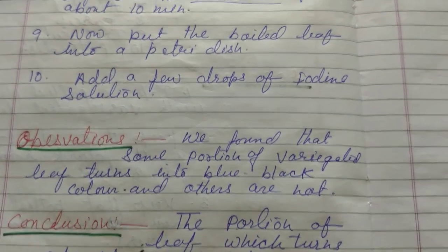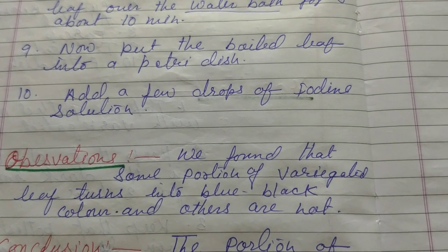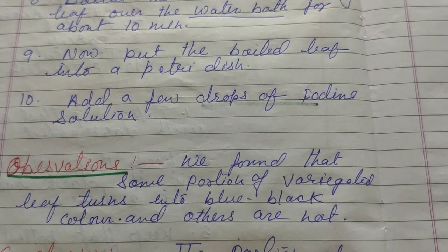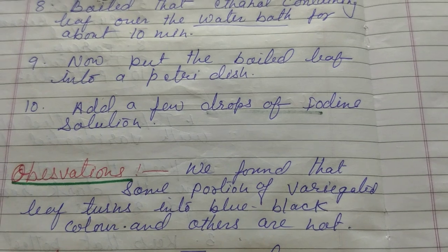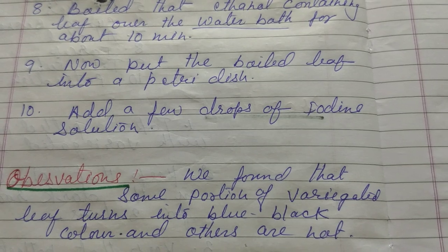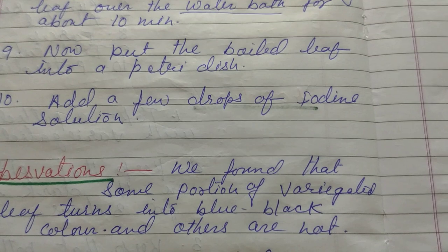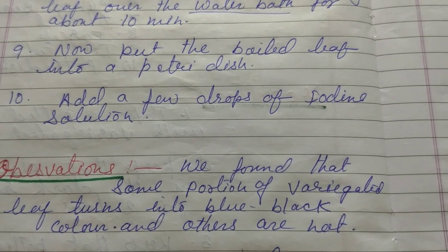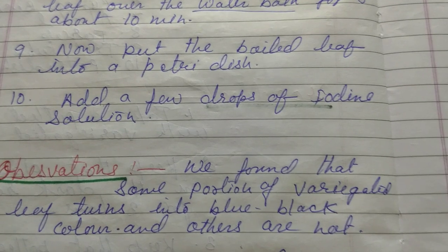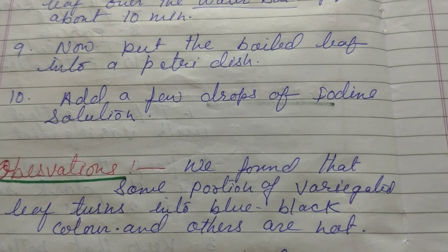We found that some portions of the variegated leaf turn blue-black in color, and others do not. When we put the iodine solution, since we chose a variegated leaf — a leaf with different colors — some portions turn blue-black, but some do not.